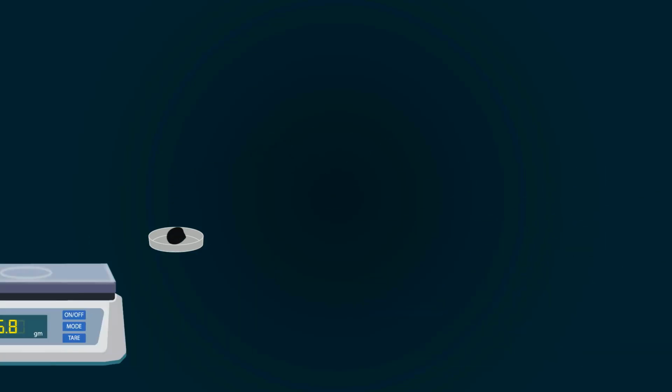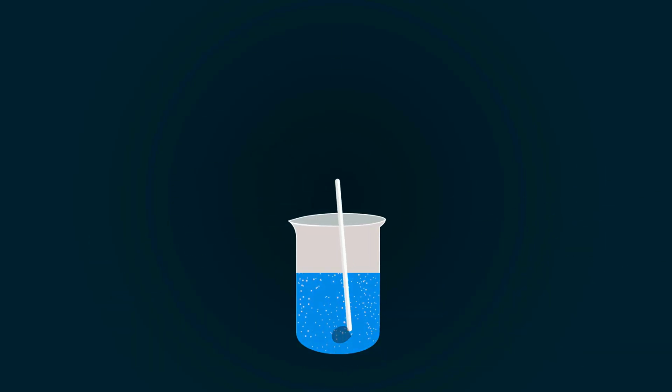In this video, you will learn how to prepare 0.1 normal solution of KMnO4.